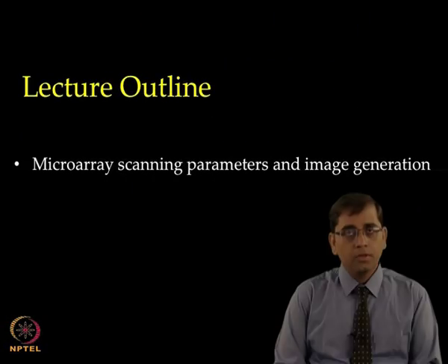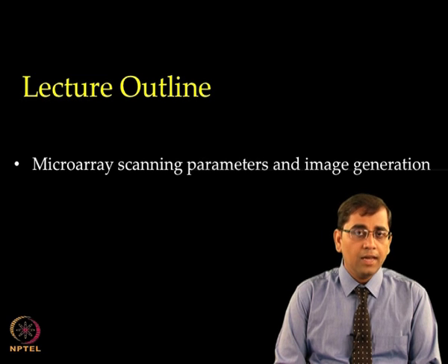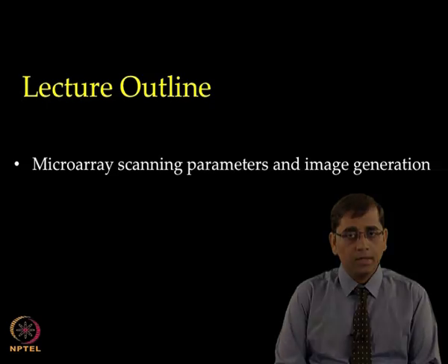Today we have with us Mr. Pankaj Khanna, who will be talking about the GenePix microarray scanner from Molecular Devices. We will first have a discussion about the microarray scanner as well as the software which controls it. We will talk about various concepts as well as a live demo of the software interface in the subsequent lecture, so that you get a better understanding of how this whole process is controlled and can be performed. This demonstration will help you get a unique learning experience through the user interface of this specialized software.